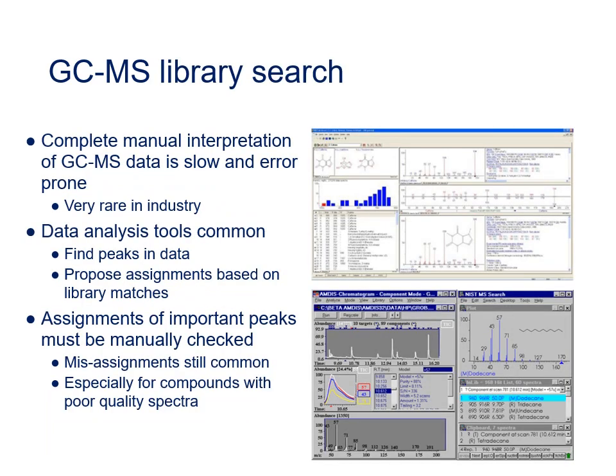Experts in EI mass spectrometry can manually interpret EI mass spectra to identify or propose some or all of the structure of the relevant analyte. However, this process requires a very high skill level and lots of experience, and many samples can contain hundreds or thousands of components, where manual assignment is simply not efficient as a means to process these data.